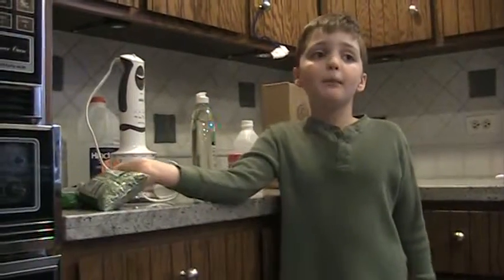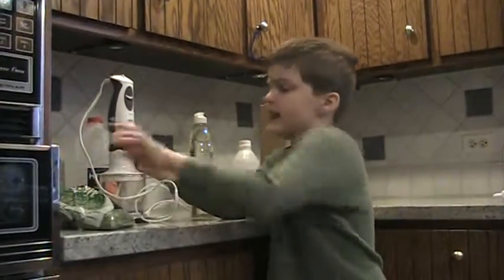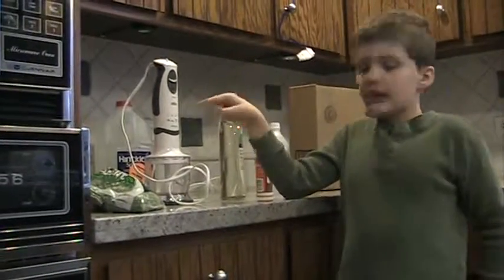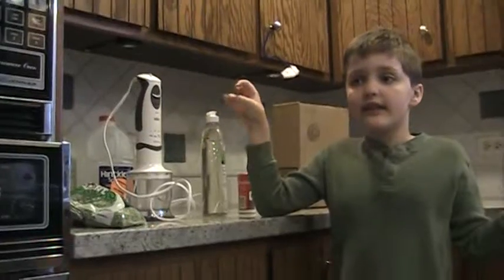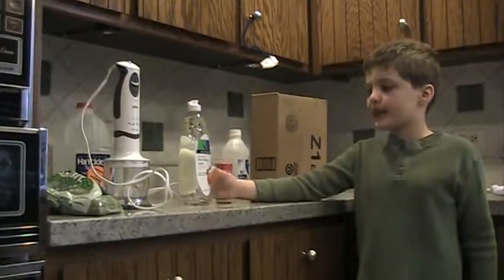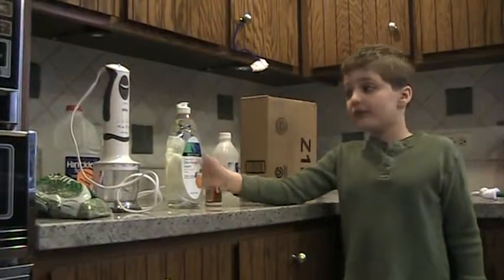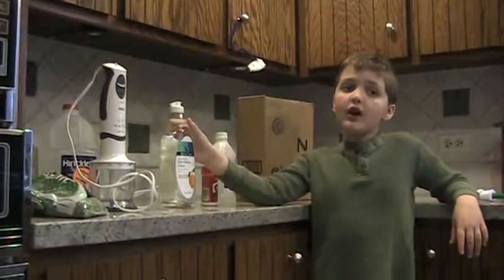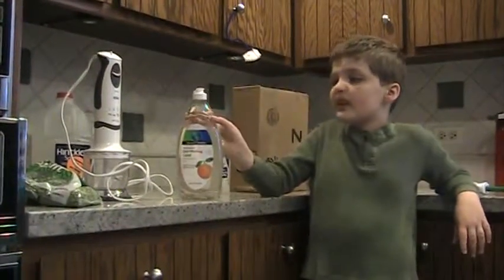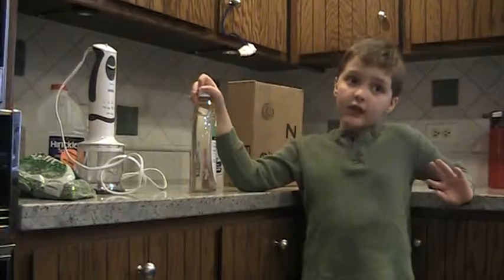Okay. Step 1. Here's the process. You put the green peas into this blender here. What it does is blend up the peas, which splits apart the cells inside the peas. Step 2, we add the soap, which frees the DNA from the nucleus, from the chromosomes in the nucleus, which are located in the center of a cell.